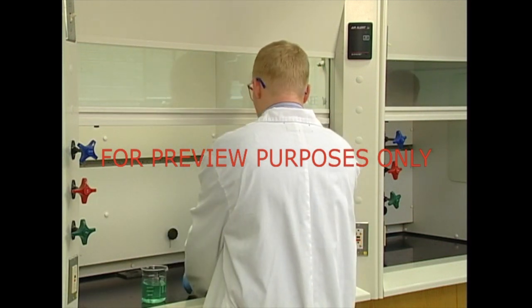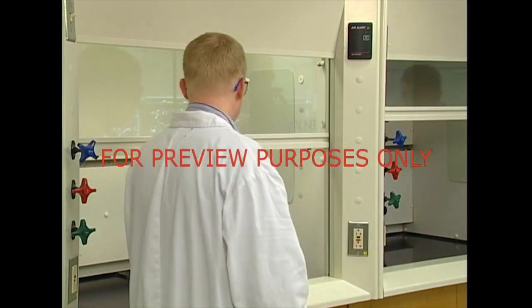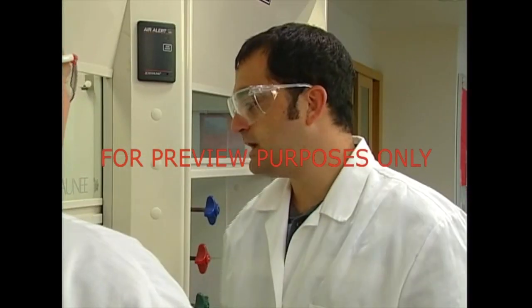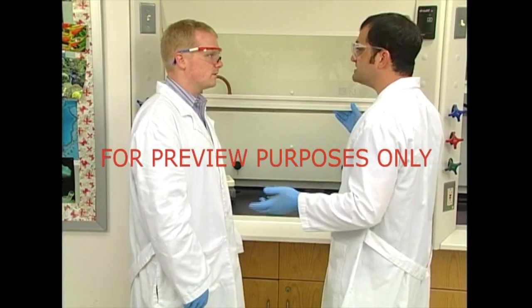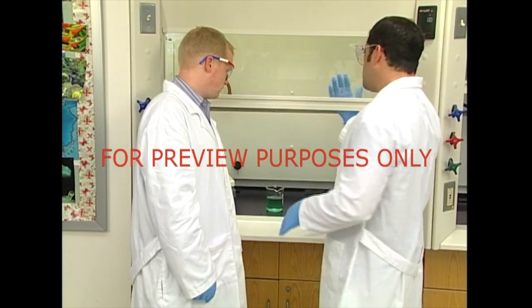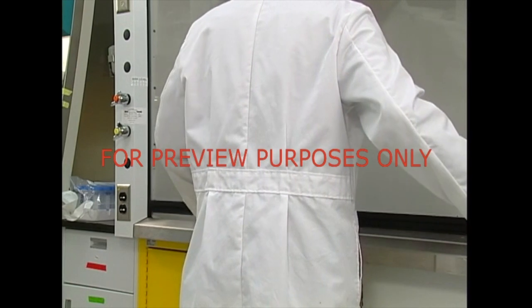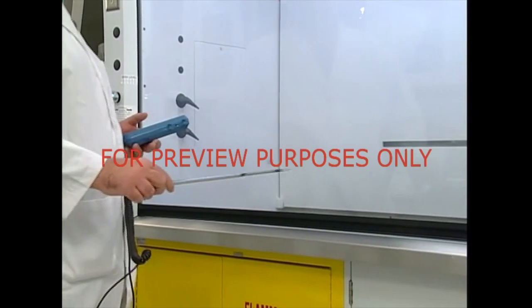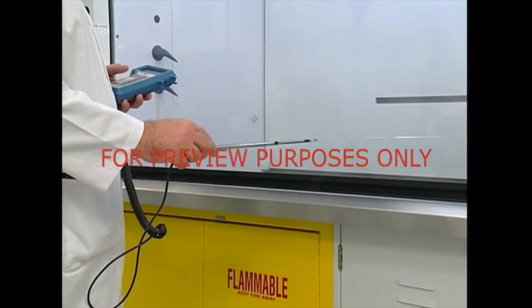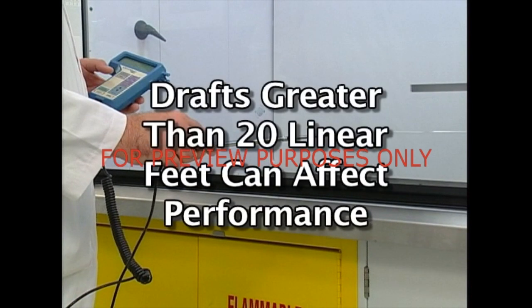To ensure that it's operating safely, each lab hood is thoroughly tested when it's first installed, whenever there's a change in the ventilation system, and on a regular basis thereafter. There are specific steps that need to be taken to determine if a hood is operating the way it should. First, the air circulation around the hood should be checked. Your supervisor or a qualified engineer will measure the flow of air six inches in front of the hood. This cross-draft should be monitored carefully. Drafts greater than 20 linear feet per minute will adversely affect the performance of the hood.